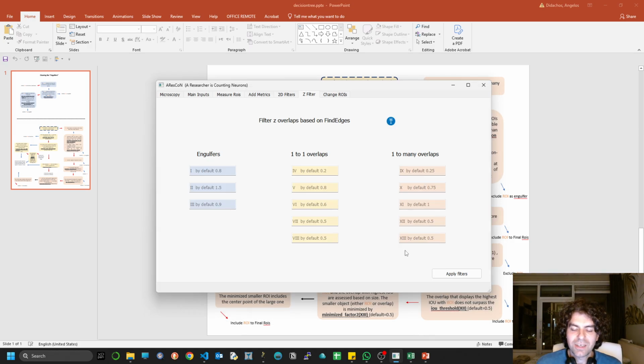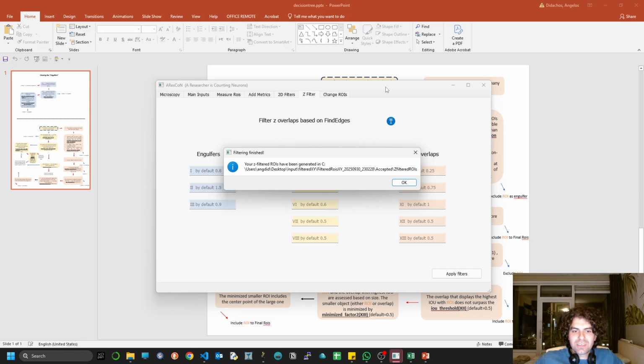We're going to open the file, and again, I believe that I included a message after the filtering is done. Let's just make sure that this is the case. Cool. So that's for now the final step. Let's see how well it works, and again I will shortly explain what the future steps are.